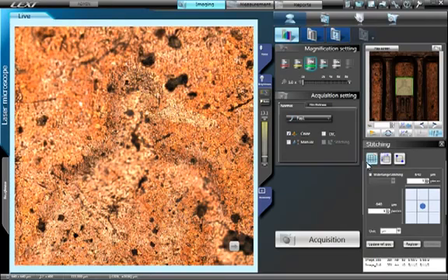There are a few ways in which the panoramic area can be defined. One way is to define the number of images to be acquired in both X and Y. You will notice the map area is dynamically updated as you define the panoramic area. This provides a very intuitive preview of the area that will be acquired. The blue circle in the Stitching window represents your current position as it relates to the acquisition path. Notice how the acquisition path changes in the map screen as you redefine this reference position.